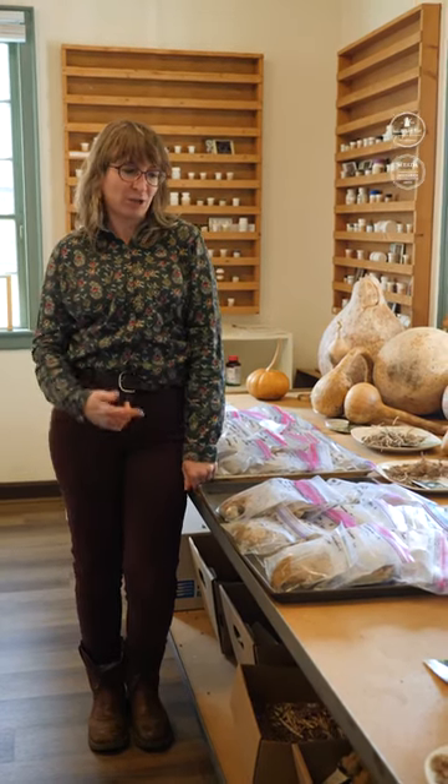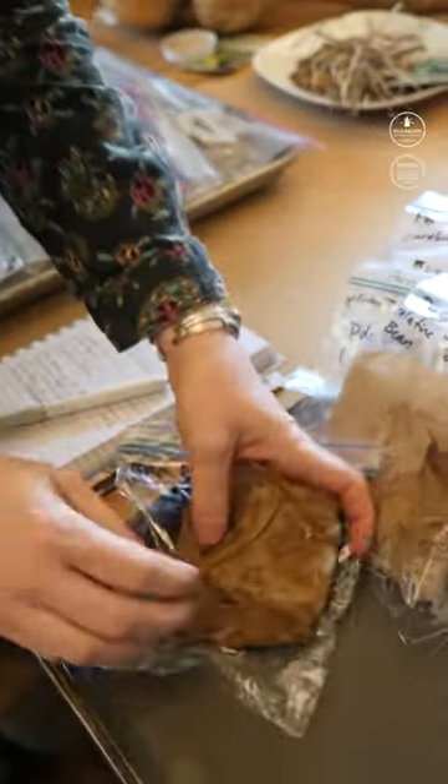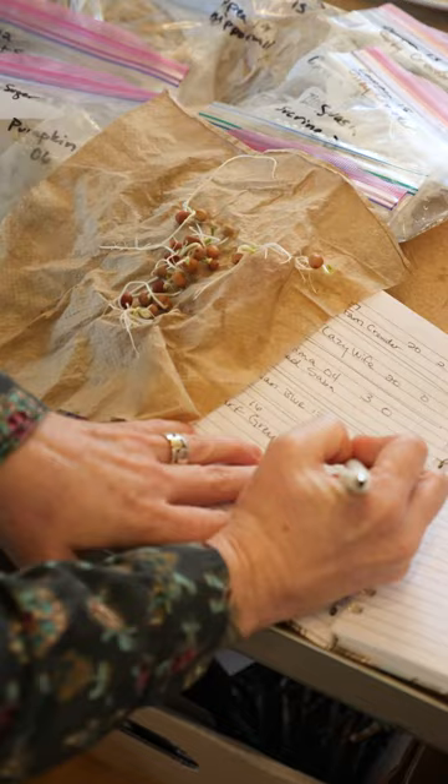Hi, I am Katie Inglehop, the Education Coordinator of Agriculture and Gardening here at Old Salem, and today we're in the seed lab. We are doing germination tests. A germination test is where you check to make sure that a plant can still grow from seed.